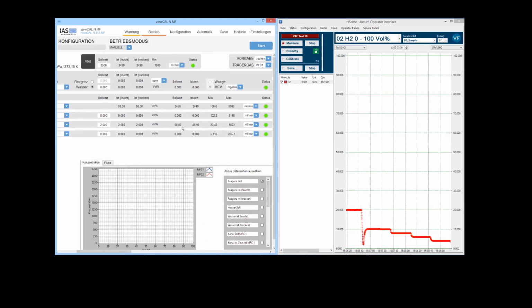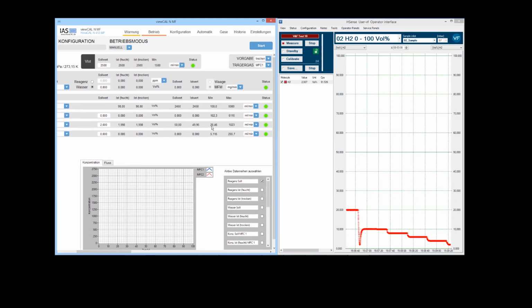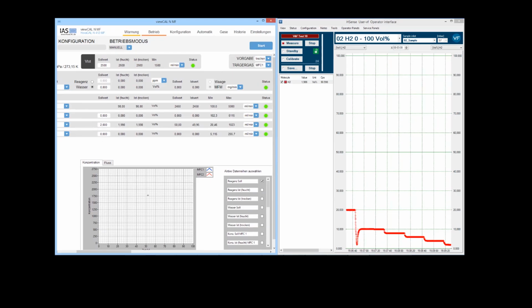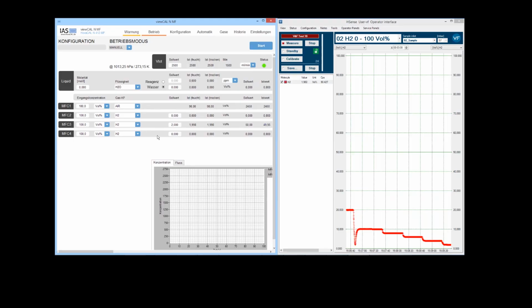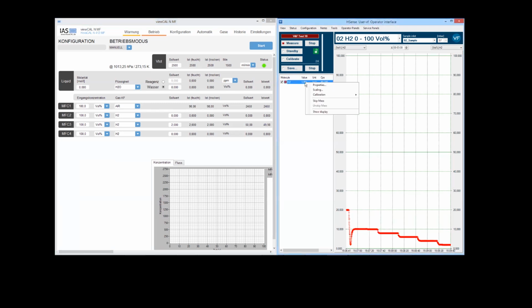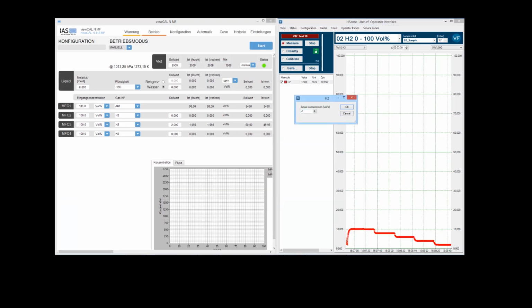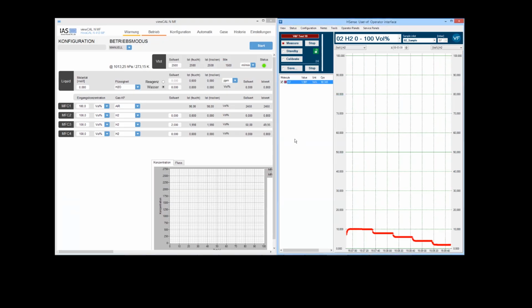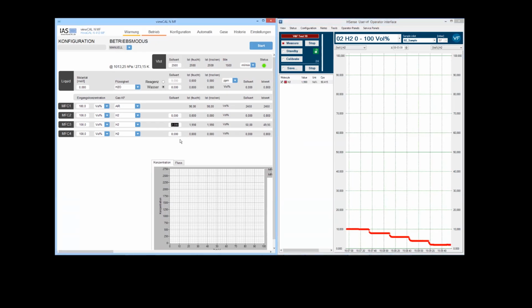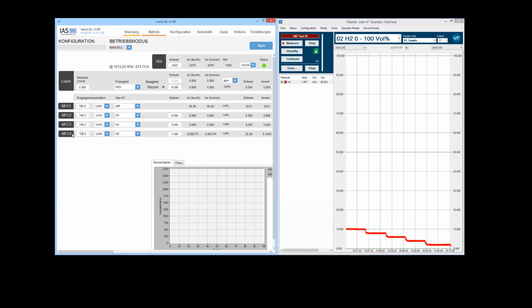Now checking the ranges for these mass flow controllers, we see that we are almost at the edge of our mass flow controller 3, which has a minimum flow rate of 20.46. So in the next step, we're going to switch over to our mass flow controller 4 in order to do the last 2 steps. And we don't want to forget to establish this point before we switch. Again, we're going to go to 0 concentration on mass flow controller 3. And our last 2 points will be 1 volume percent, for which we're going to use mass flow controller 4.